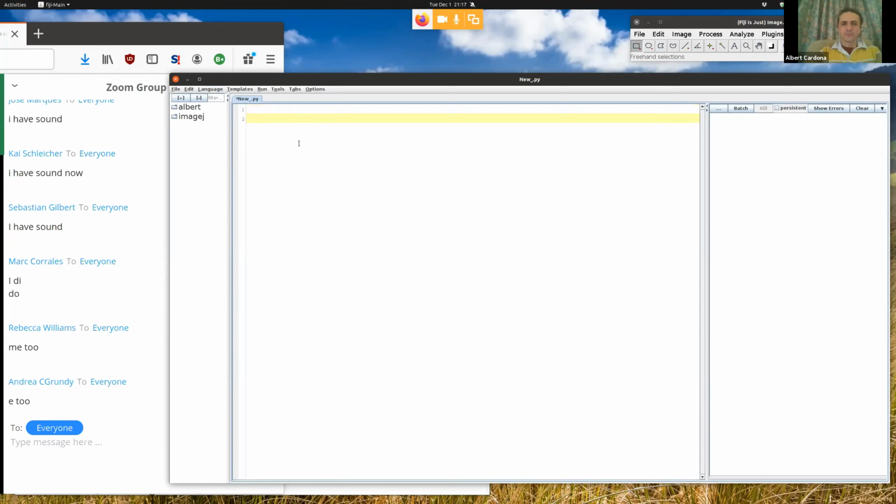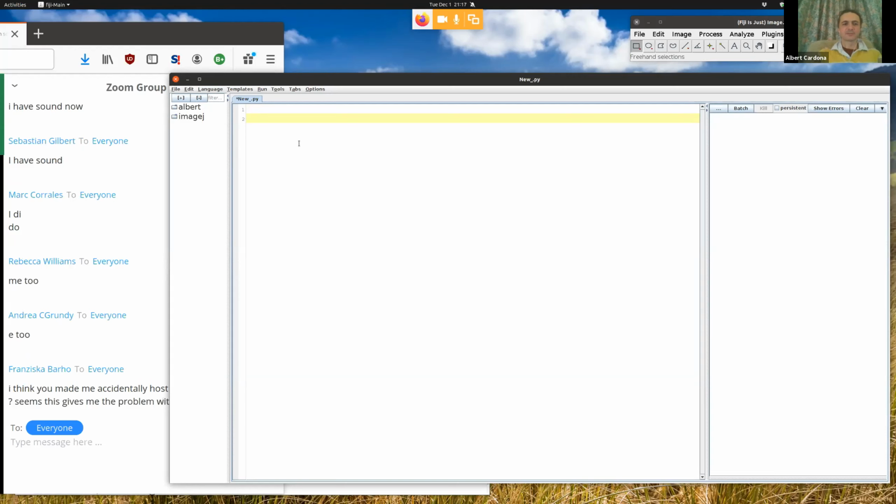What I'm going to show you first is how to deal with graphical interfaces. Because what we need to do now is, suppose we have a large collection of files. This collection is, like I said, maybe in the 100,000 of files.